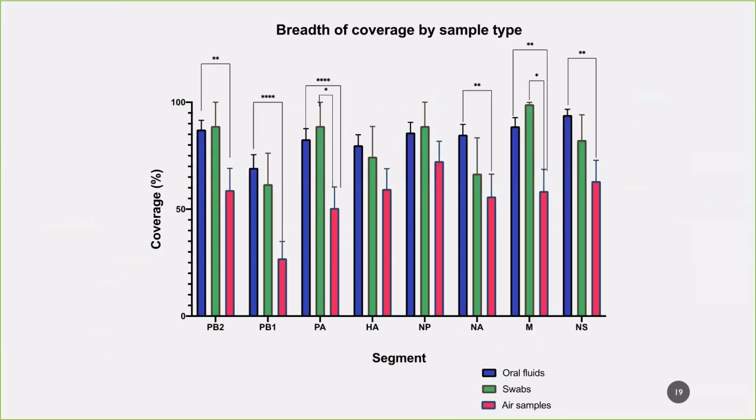I also wanted to look at the breadth of coverage by segment as well as sample. The blue bars are the oral fluids, the green bars are the environmental swabs, and the pink or red bars are the air samples. The air samples were significantly lower in coverage than the oral fluids for almost all of the segments. However, you don't really see a statistically significant difference between the environmental samples and the oral fluids. So this is showing that the environmental swabs may actually be just as good as the oral fluids in terms of coverage. Next slide.